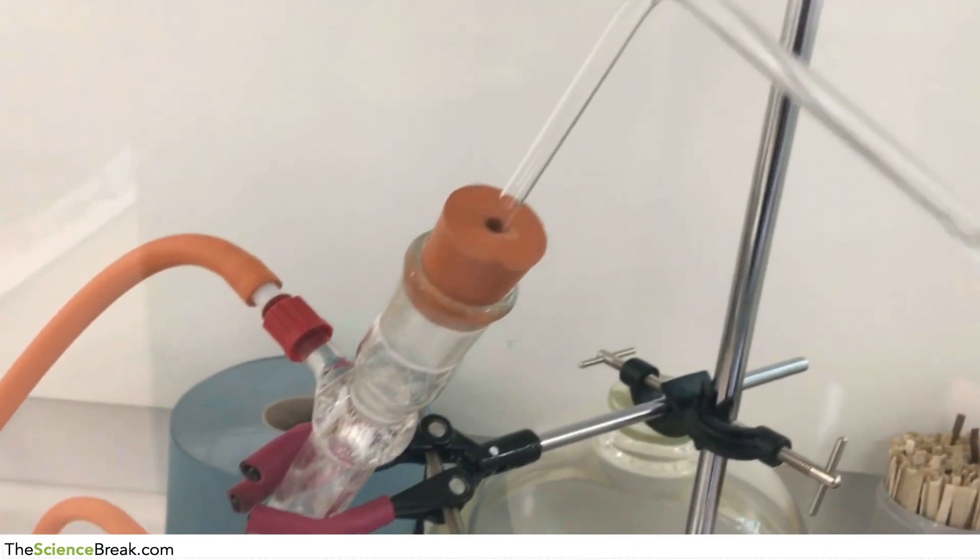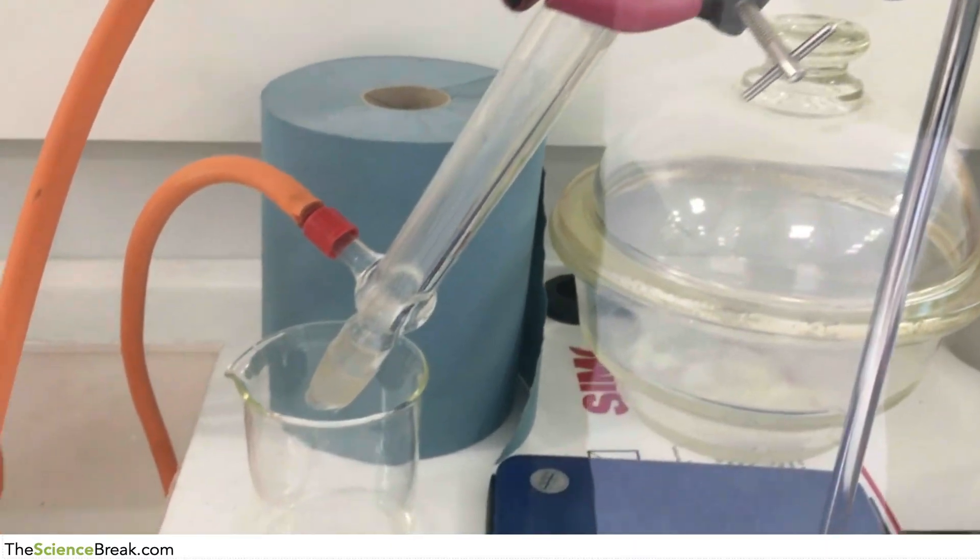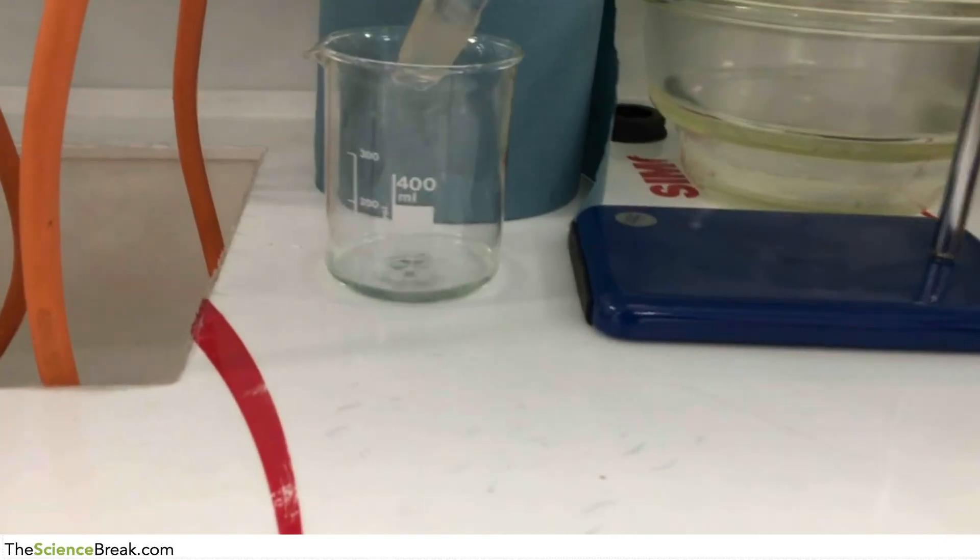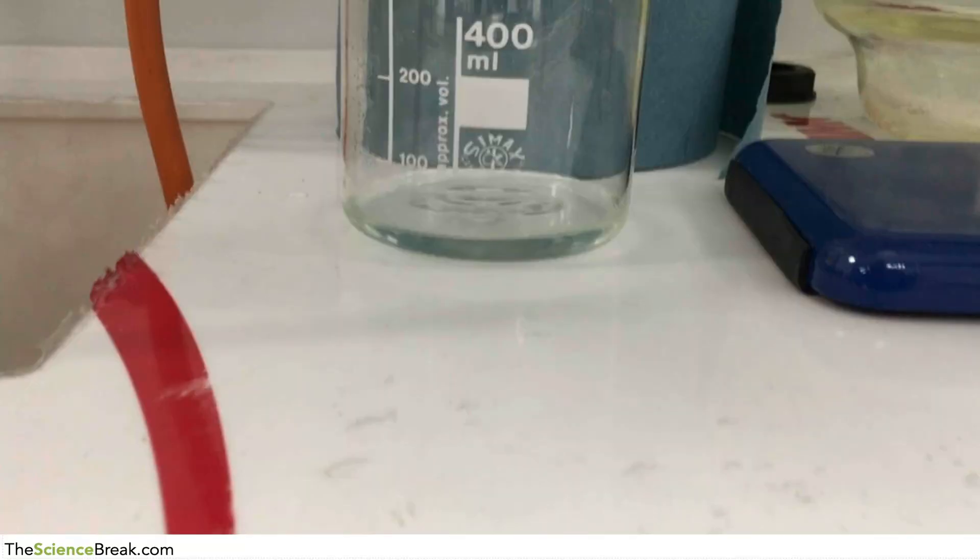The vapor is coming out, passing through the delivery tube, through the condenser there where it's being cooled, and then condensing back into a liquid. You can see there the liquid ethanol separated from that very dark green mixture that we had at the beginning.